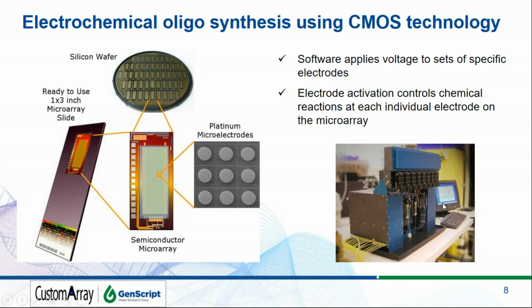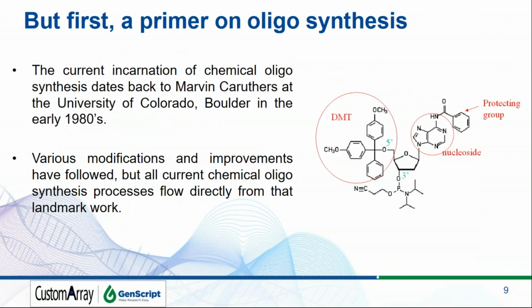Over here you have the actual synthesizer itself. As I said, it's a rather simplistic machine. All it really is is a fluid mover. The fluid gets moved into the reaction vessels, reaction chambers, and the chip does all of the actual advanced work.